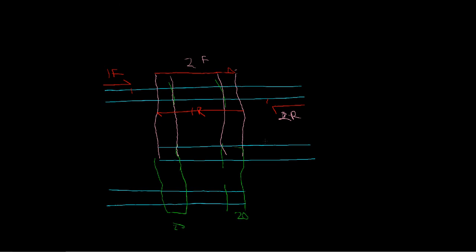So you can see that all of the original gene is encoded by this DNA, and our oligos are going to be binding either 20 base pairs upstream and downstream for both of these oligos. So the secret is that this center area right here that I'm pointing at is kind of our canvas for adding mutations.